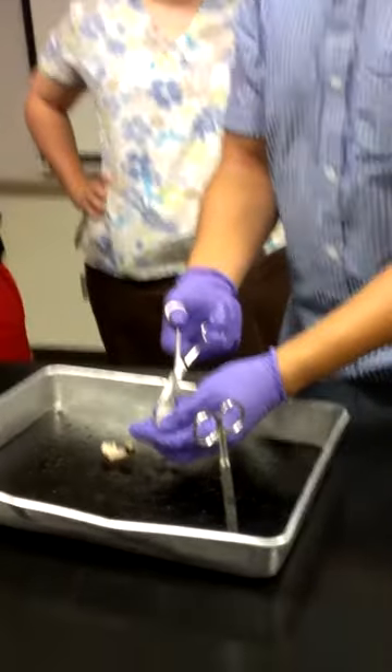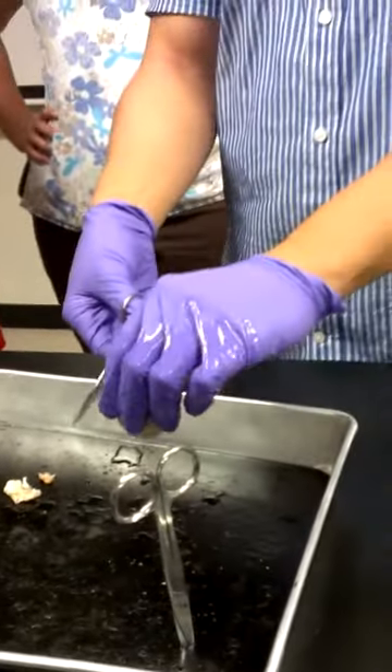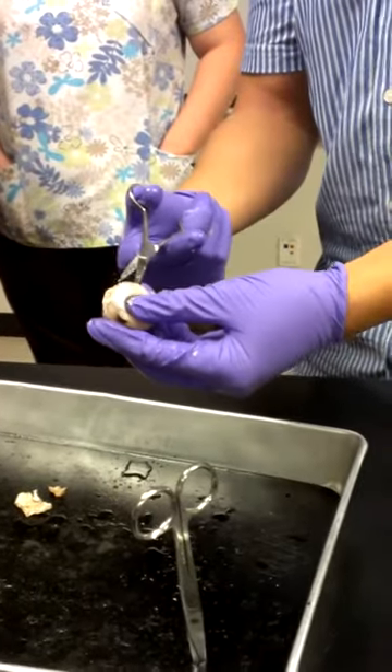Basically, the first thing you'll notice when you cut the eyeball open is that there's liquid that comes out. The liquid that comes out — what kind of humor is that? Aqueous humor, right. And that's found in the anterior part of your eyeball, the front part.